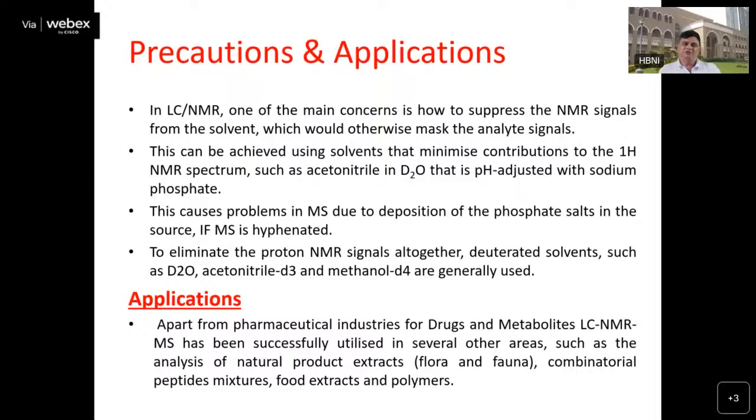These are the precautions and applications while using LC-NMR. Apart from the pharmaceutical industry for drugs and metabolites, LC-NMR-MS is successfully utilized in several other areas such as analysis of natural product extracts, that is flora and fauna, and combinatorial peptide mixtures, food extracts, and polymers.